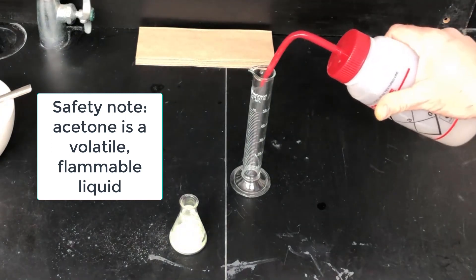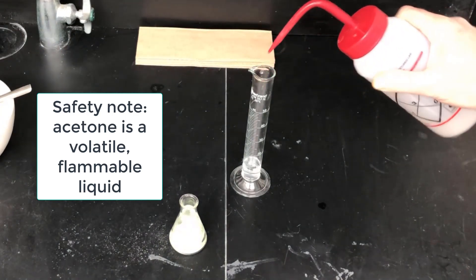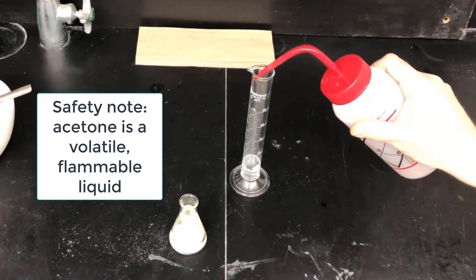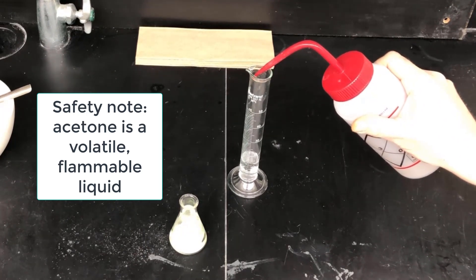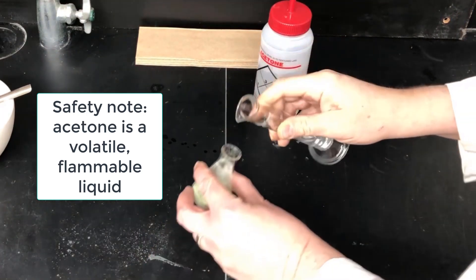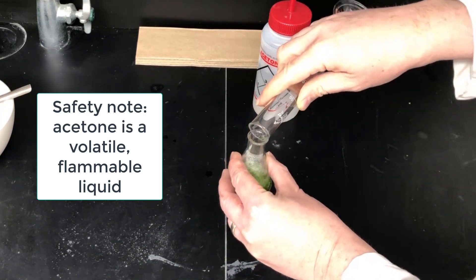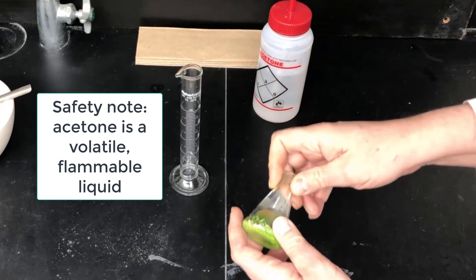So now I'm going to put some acetone in there, 15 milliliters of acetone. Now you should just be aware, acetone is a volatile flammable liquid, so you're going to want to be careful with it and avoid open flame. Take that liquid, put it in there, swirl it around.